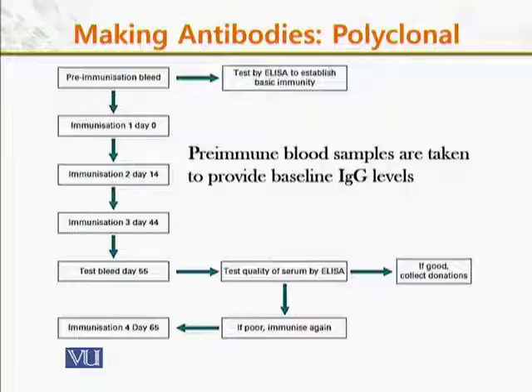Then the animal is immunized. First immunization is on day 0. Then the second immunization is after 14 days, and so on.